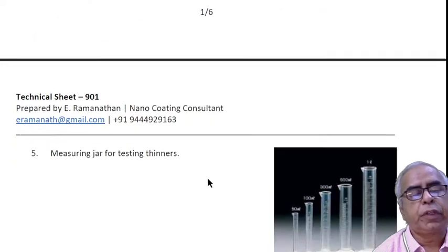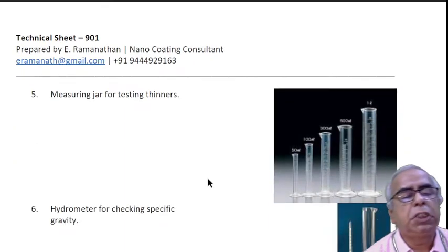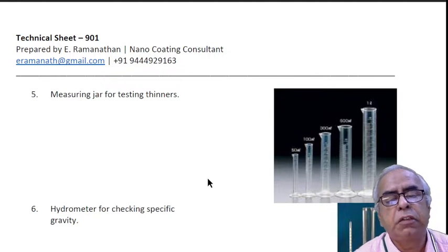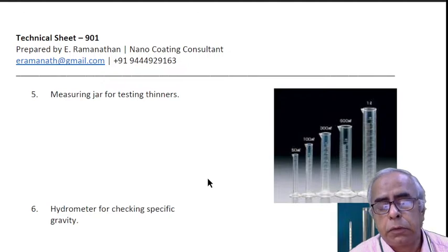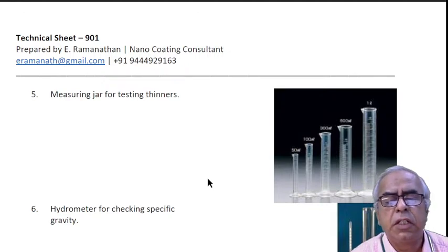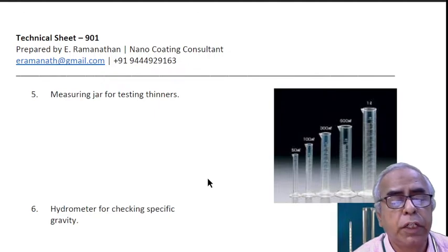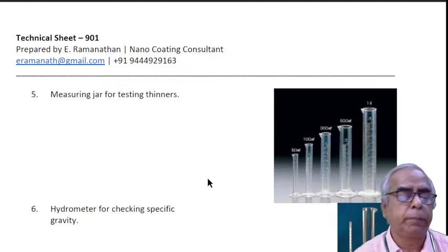We want to study the mass tone and reduced tone of the pigment. These pallet knives, also called doctor's blades, are very useful for mixing and testing. You should have measuring jars for testing thinners.